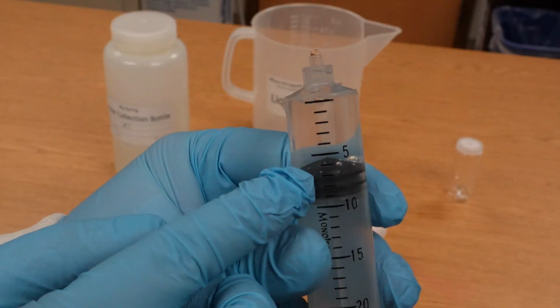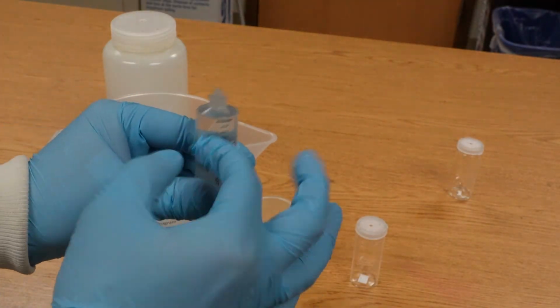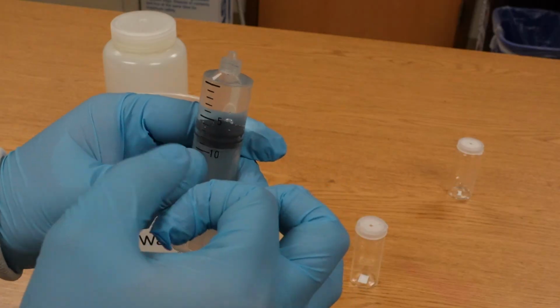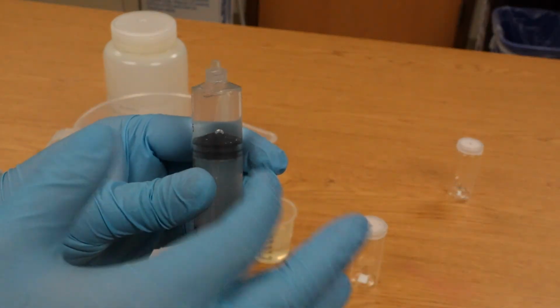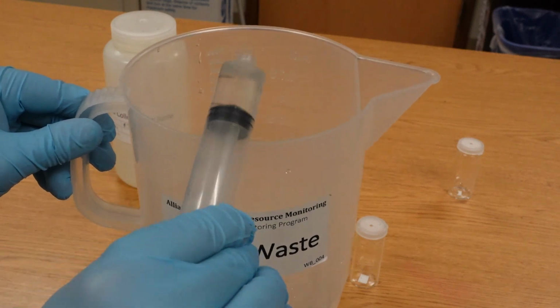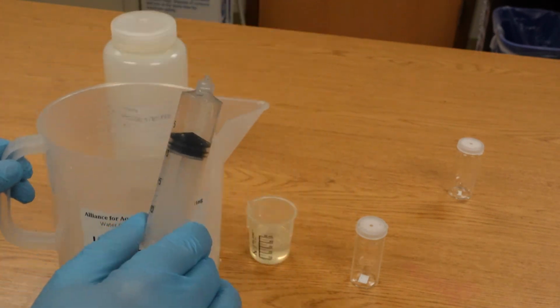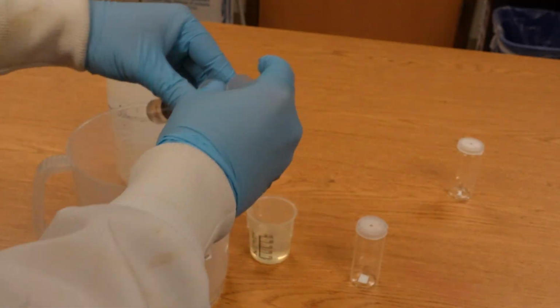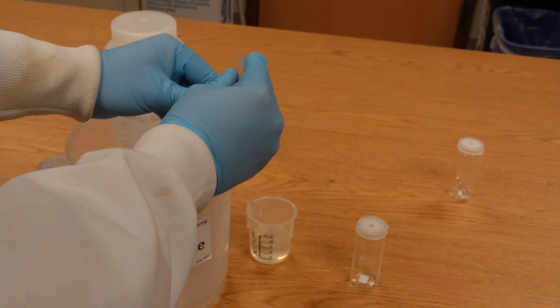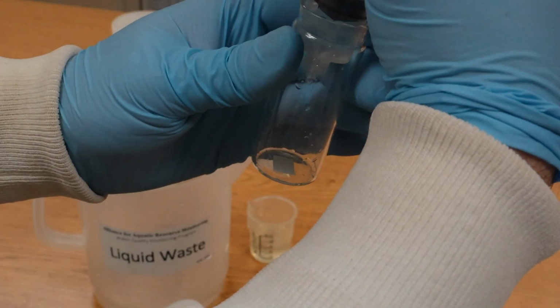To do this, draw up extra water and turn the syringe upside down, so the opening of the syringe is pointing towards the ceiling, and hold it over the waste bucket. Tap the sides or flick the syringe lightly so that the air bubbles float to the top. Now that the air bubbles have been expelled, push out the extra water until the bottom of the cone is level with the 5 milliliter line. Then, add it to the titration vial.